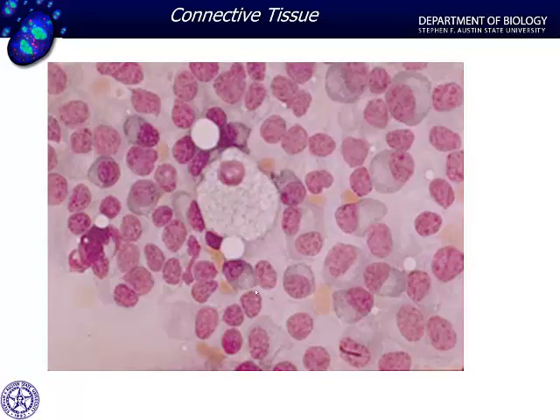Here's another macrophage. We can see cells. These are plasma cells that we see here, lymphocytes, and then this large cell, and here we've got a nucleus that's just round and in cross section, so we don't see the indentation. But notice how we have this bubbly look to the cytoplasm of this cell. Large cell, soap bubblish appearance, that's indicative of macrophage.